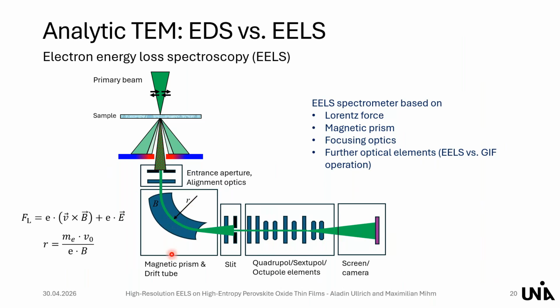You see that this setup is quite complex and quite sensitive to external disturbances. So that means, in general, when you are performing EELS, you always have a little bit of movement of the spectrum in the energy dispersive plane on the camera. It's never perfectly constant, and it requires more or less permanent tuning of these alignment optics. It's always a little bit unstable, in the range of a few, let's say half an eV or 1 eV, and therefore we are using the so-called dual EELS mode.